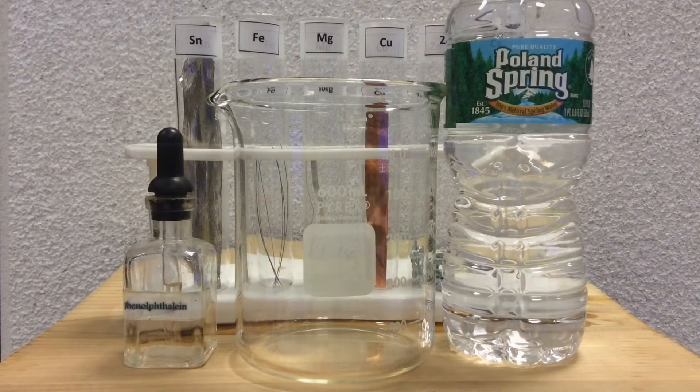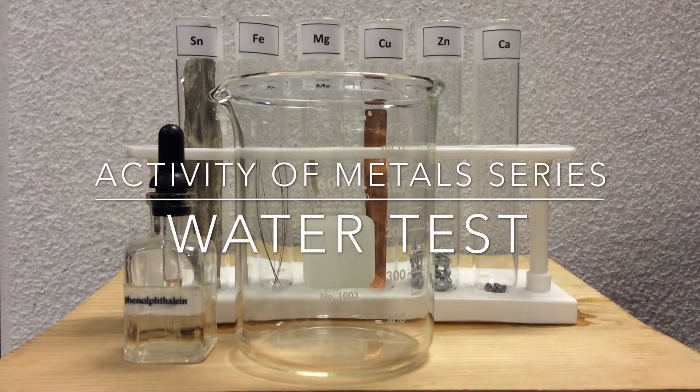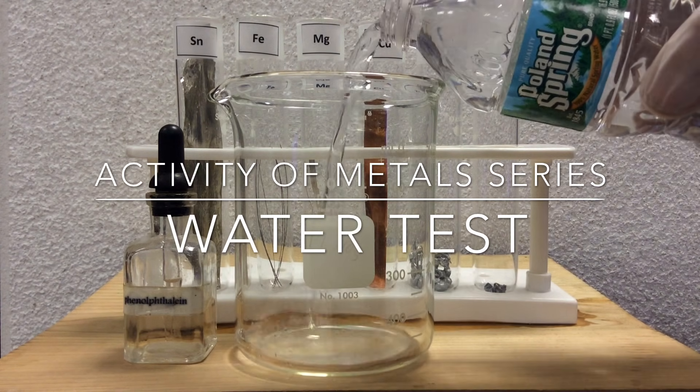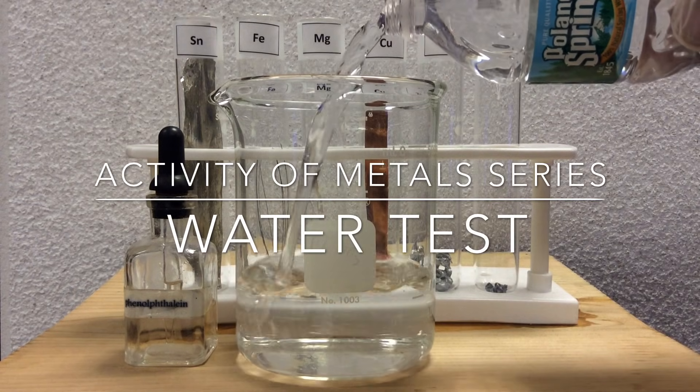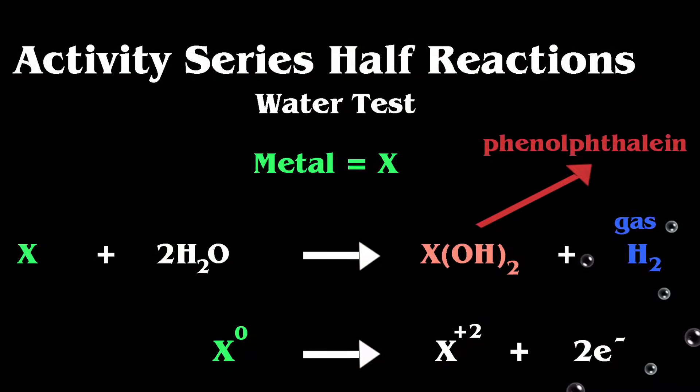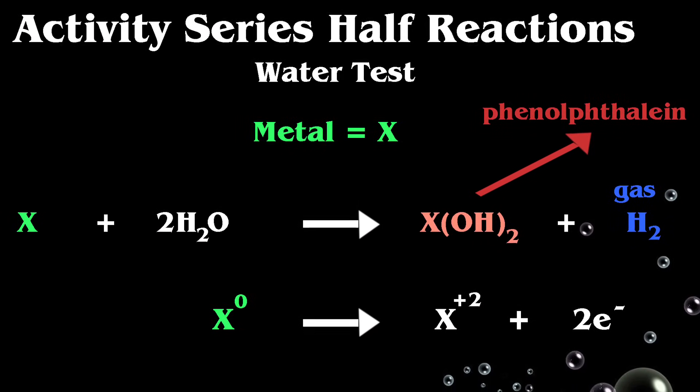So our second test here is going to be with water. And it's a very similar reaction. And we're going to add phenolphthalein to that to see how the water reacts with the metal. Now as we look at the half reactions coming up, we can see that the water is going to react with the metal to make a hydroxide, a base.